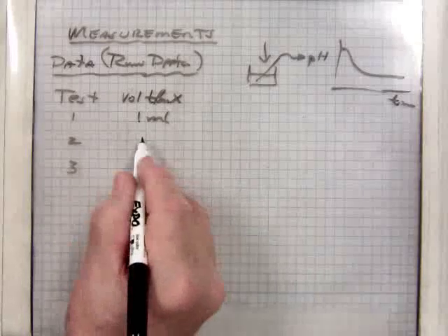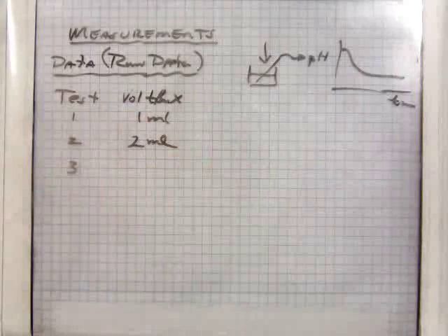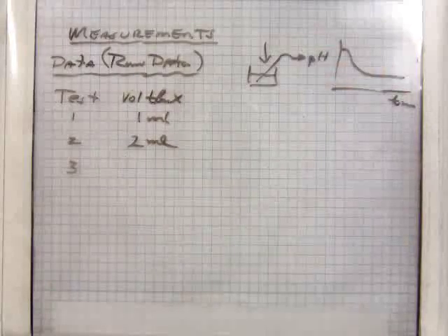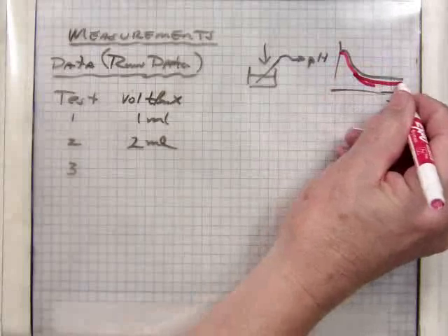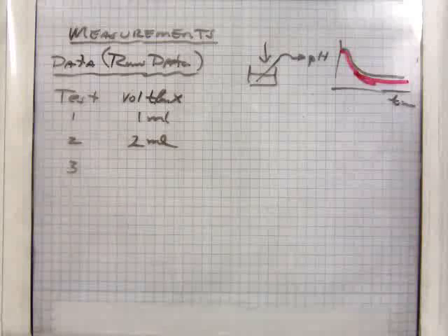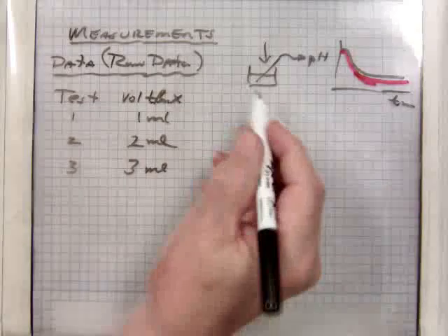Then you'll clean up and you'll have beaker number 2, and you'll inject a 2 mil sample. You'll increase the concentration. You'll double the concentration, because we want to see what doubling concentration does. And it generates the second curve. And you'll find out, let's say it comes down through here, like that. And then you will do the third concentration. You'll set it up again.